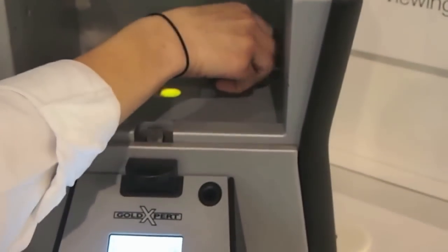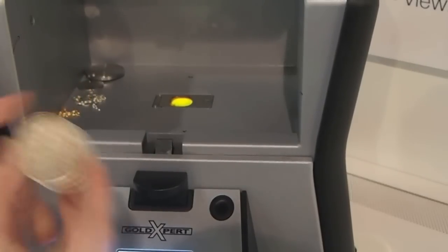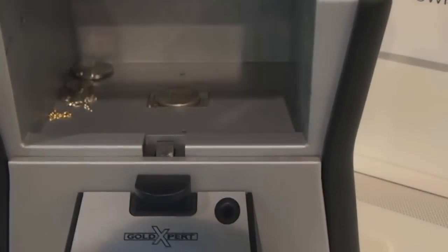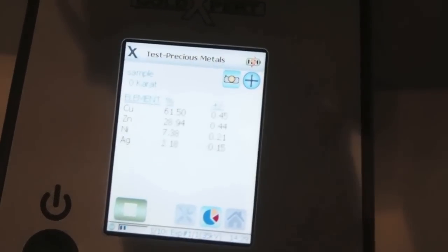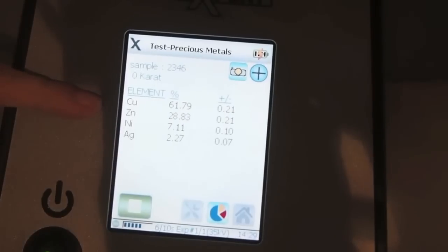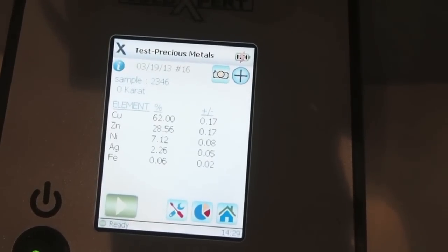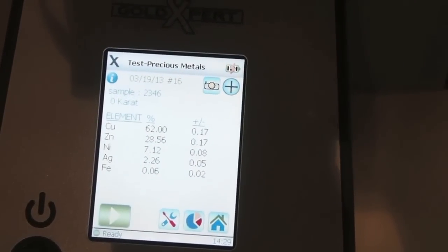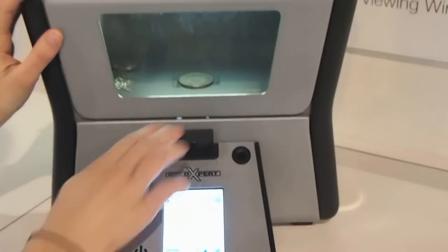We have a great example of a coin that is supposed to be 100% silver. It's very authentic looking — it's stamped from the 1800s — and if we take an analysis on it, we find that in fact it is mainly copper and zinc, so it's a bronze alloy that is only silver plated. So if I were offering someone money for this, I wouldn't offer very much. I would know that it's not an authentic coin, and I shouldn't pay the full weight of silver for it.